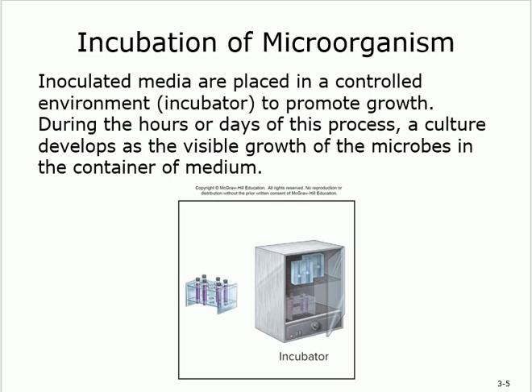How long should you leave it in the incubator? It depends on what you are studying. There are certain species that will take hours, a couple of hours, and that's it. Others will take days. And then you are going to look at it, look at it with your eyes and see the changes happening.